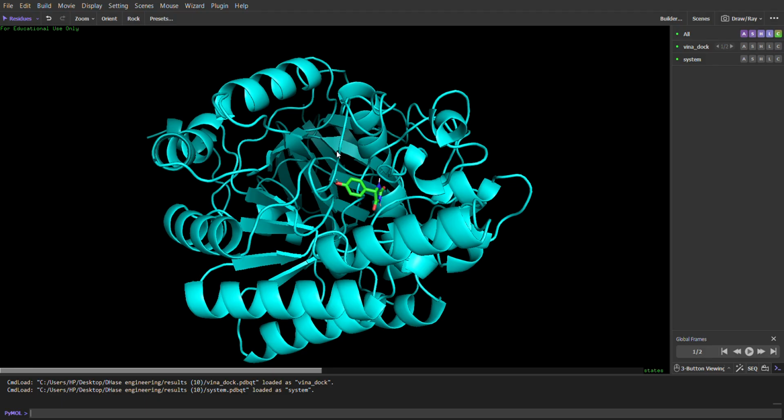However, if a substrate prefers alanine, and another substrate prefers serine, an enzyme having either serine or alanine might work, because the level of vibration of serine and alanine might be the same.